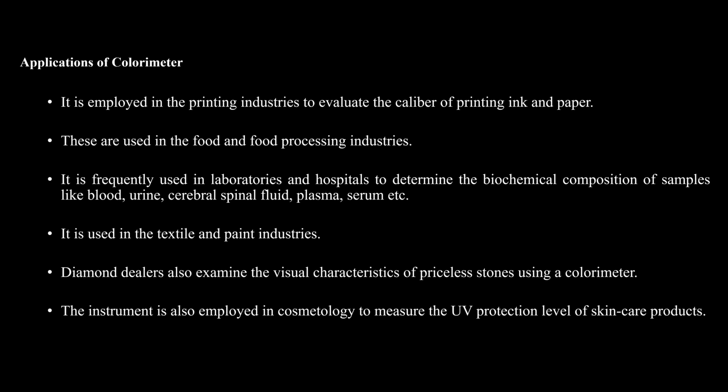Applications of the colorimeter: in the printing industry, evaluating the printing ink and paper; in the food processing industry; in laboratories and hospitals, to determine the biochemical composition of samples like blood, urine, cerebrospinal fluid, plasma, and serum; and in the textile and paint industries. Diamond dealers also assess the physical characteristics of stones using the colorimeter. The instrument is also employed in cosmetology, measuring the ultraviolet protection level of skin care products.